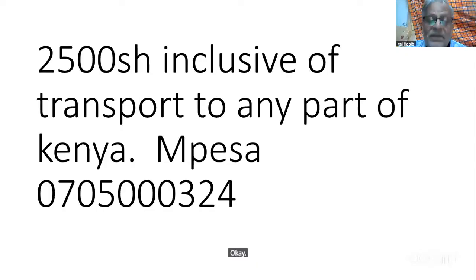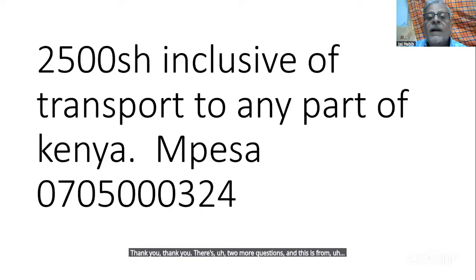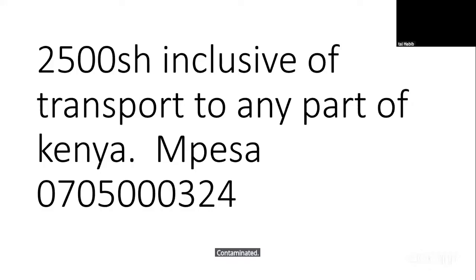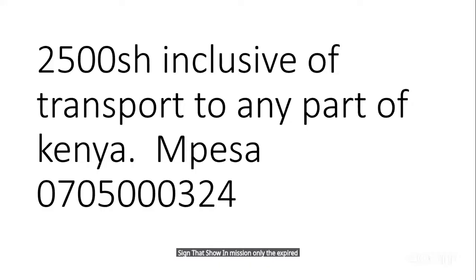Okay, next one. Thank you. There are two more questions. This one is from Mbeyu Caroline. Are there signs that show immersion oil is expired or contaminated?